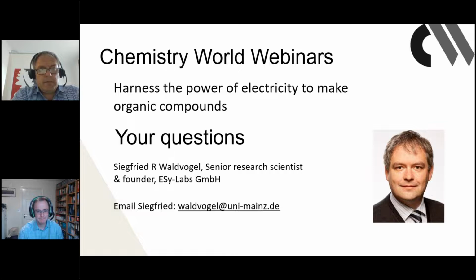Indeed, there are some people who do that, like the Atobe group in Yokohama, and we also played a little bit around with that. Keep in mind, if you have an electrode which is a composite of several materials, ultrasonic treatment can destroy this electrode. The idea behind it is that you use the ultrasonic treatment so that the stuff comes off the electrode and you have better mixing for the mass transport. Unfortunately, this could also enhance the corrosion.